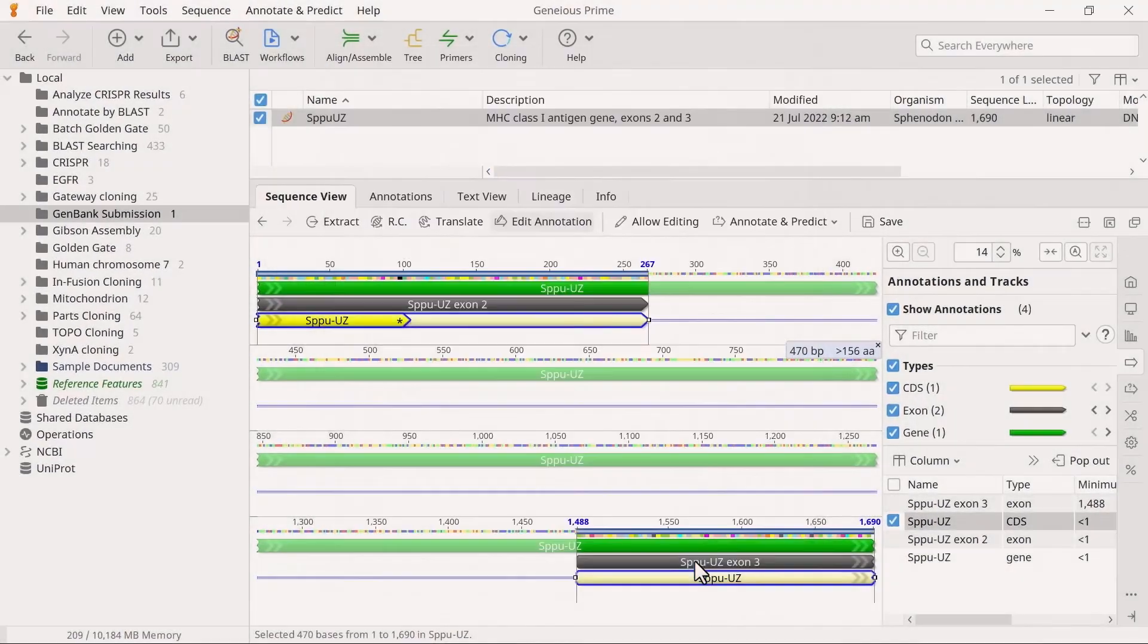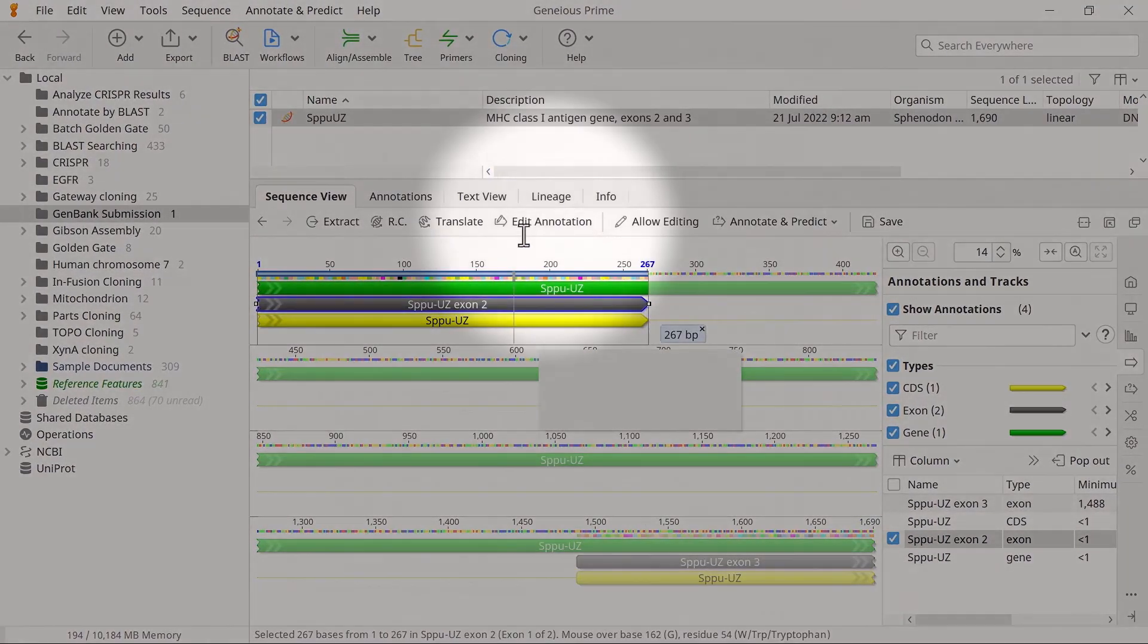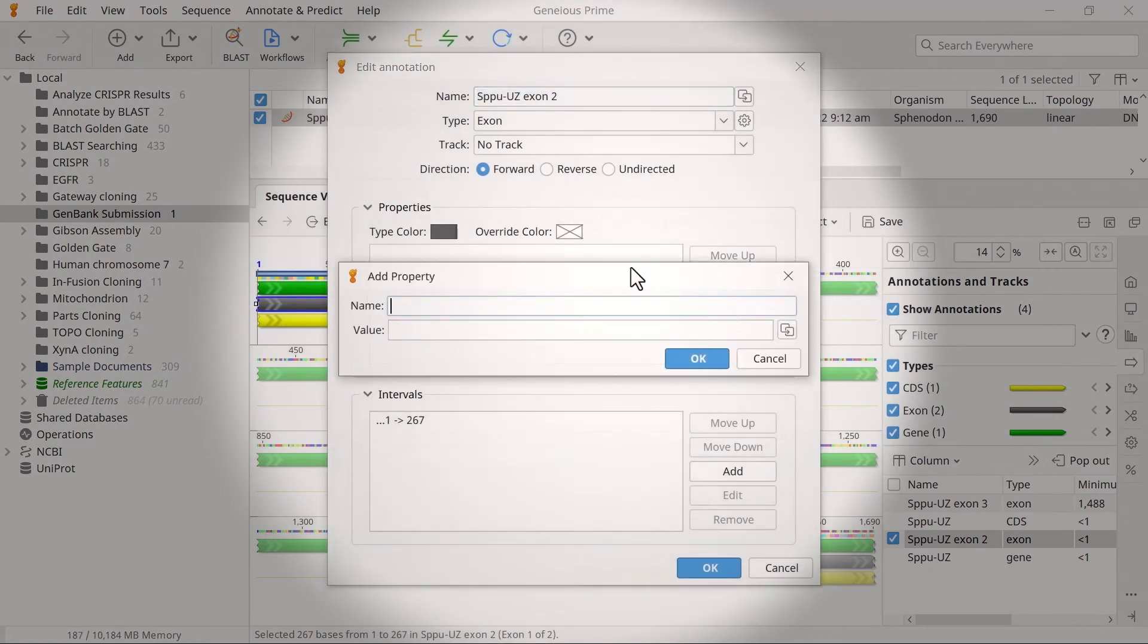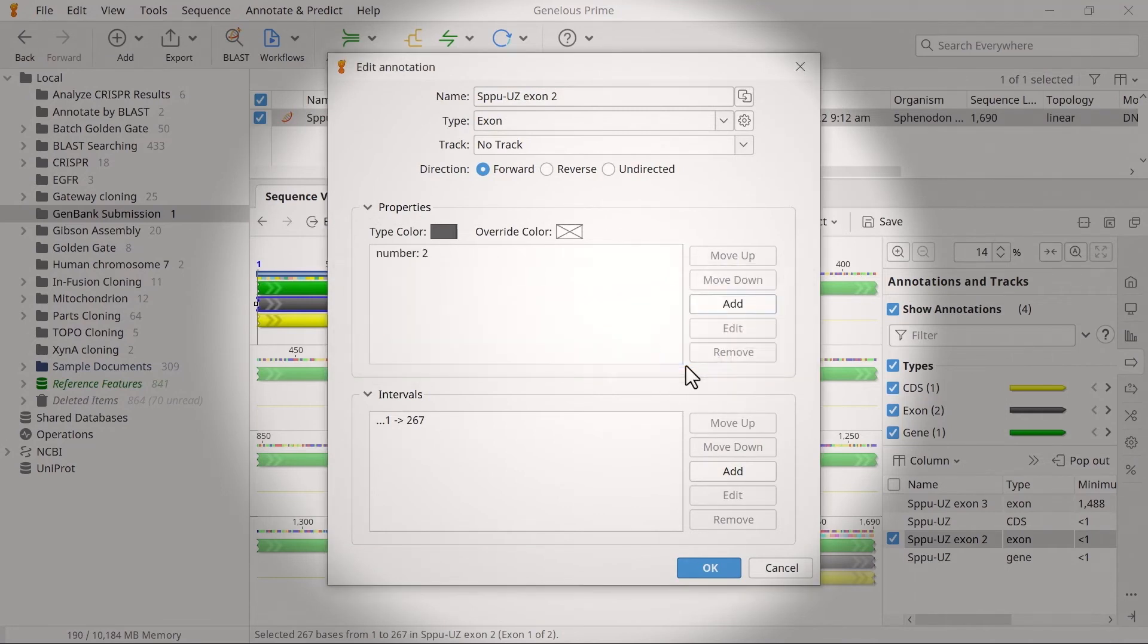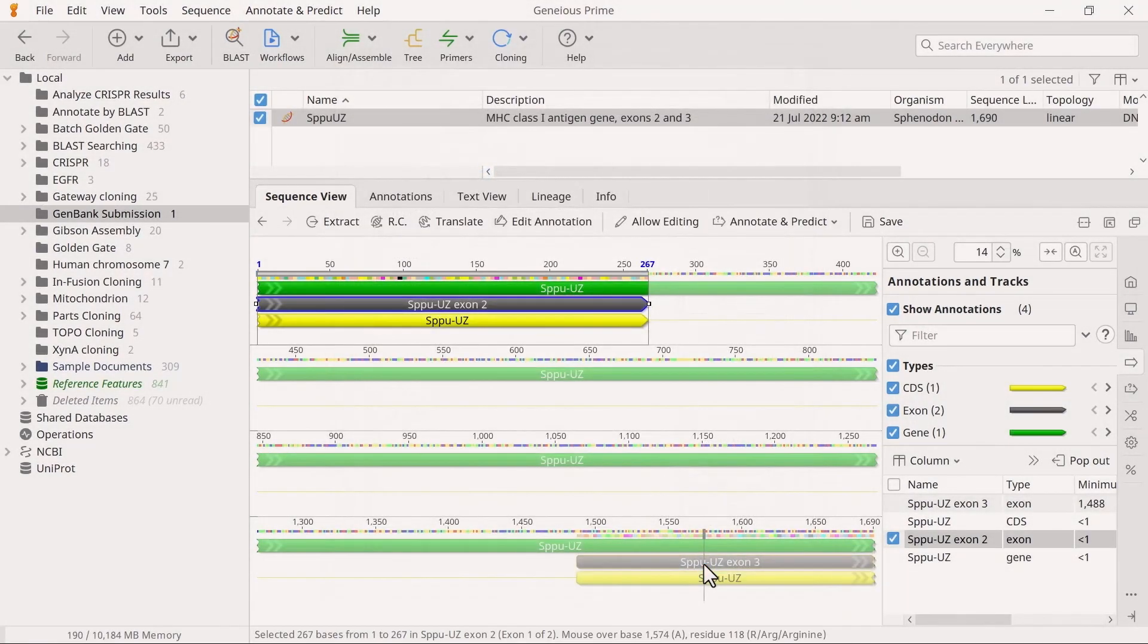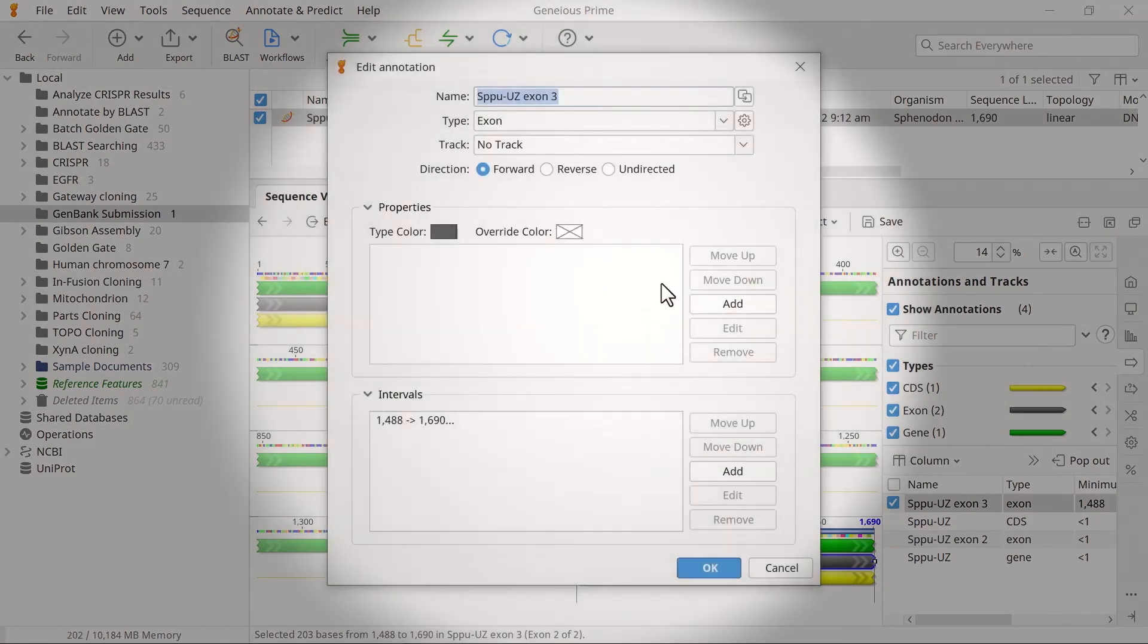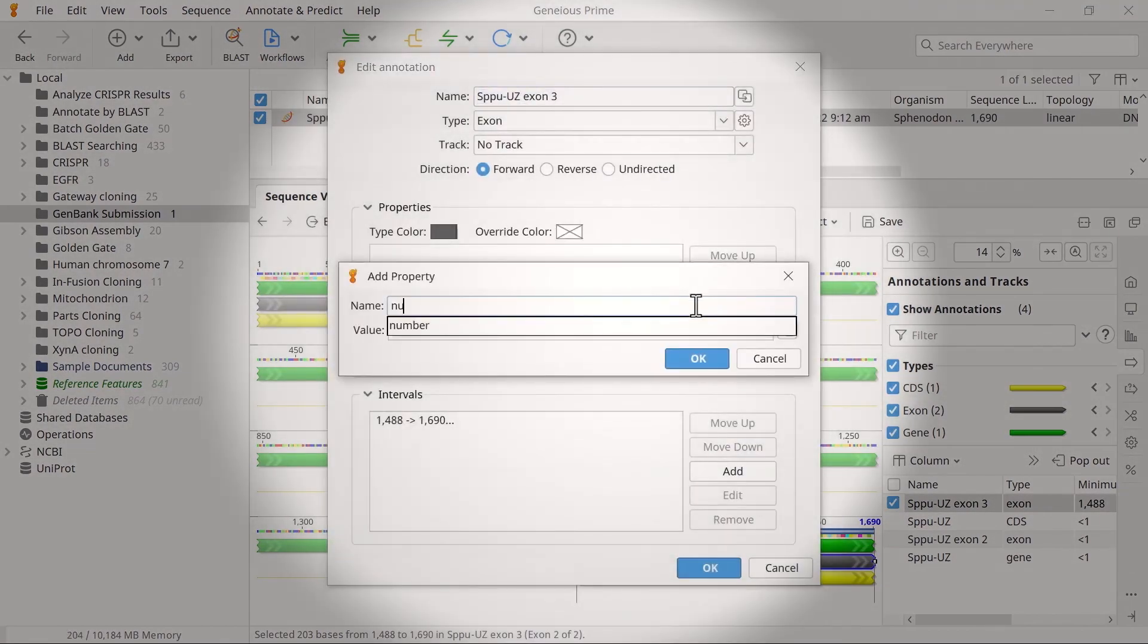If your sequence contains exon annotations, they each require a number qualifier. This qualifier represents the exon number, so if this is the second exon in the gene, enter 2. Then repeat this process for all other exon annotations in the sequence.